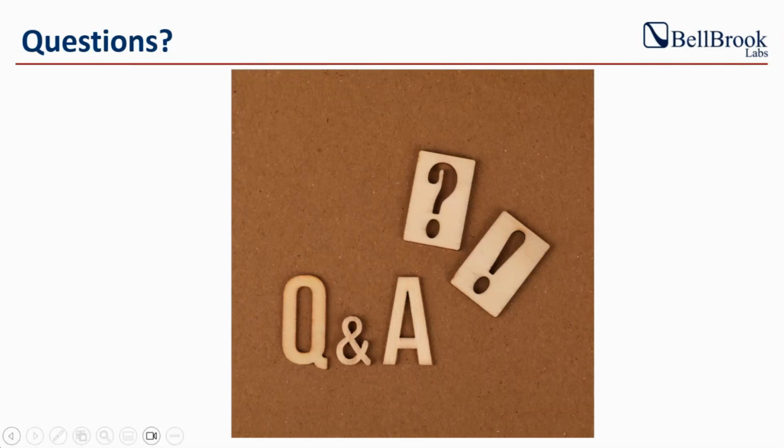Hi, so we have a few questions here. We'll start with this one here. You mentioned tuning the dynamic range for ADPR detection. Is that something we will have to do with CD38 or PARG?